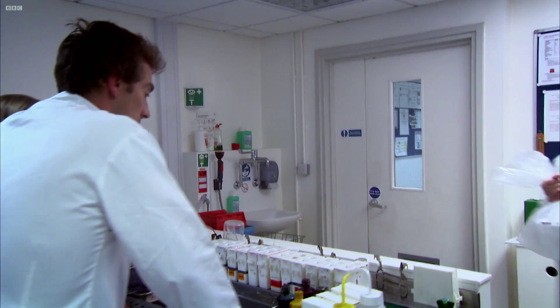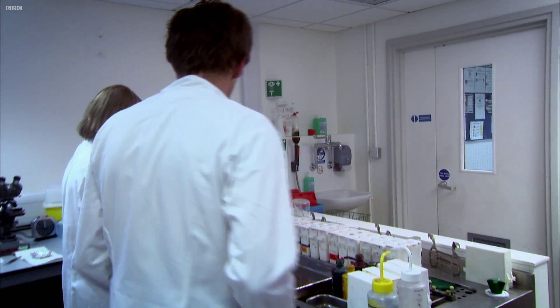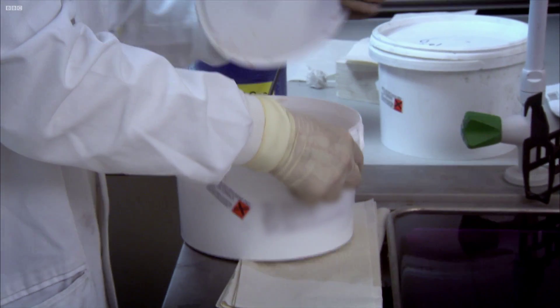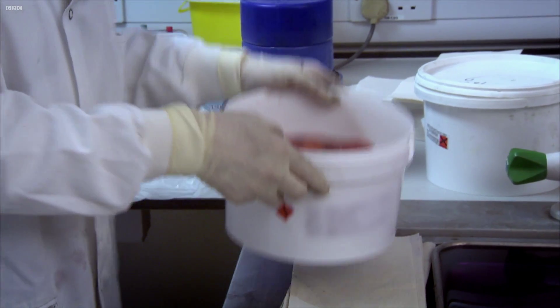She receives fresh tissue from the theatre and carries out a routine diagnosis before taking any samples for the bank. The first step is to paint the surface of the tissue, which marks the margins — if any abnormality goes to the paint, they know the tumour is too close to the edge.